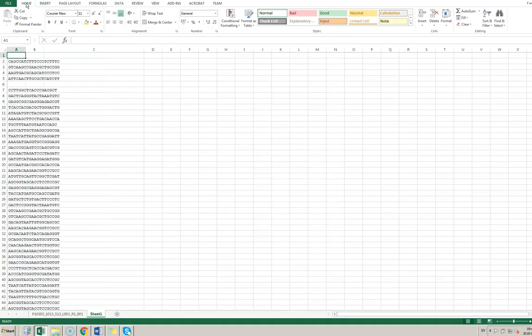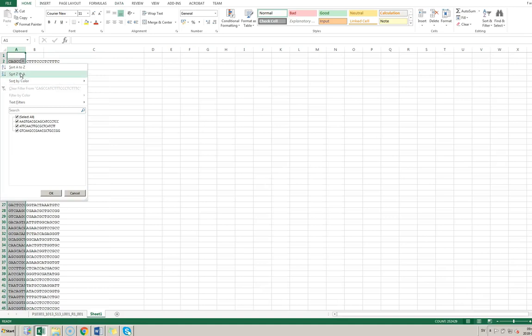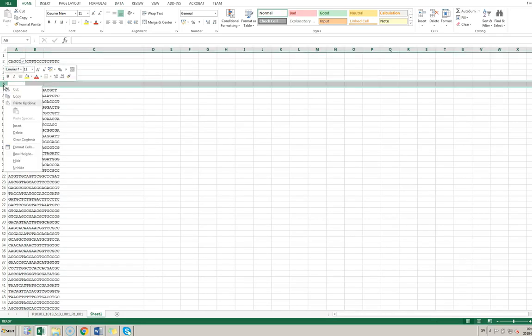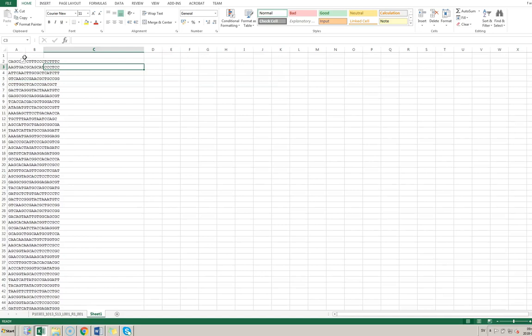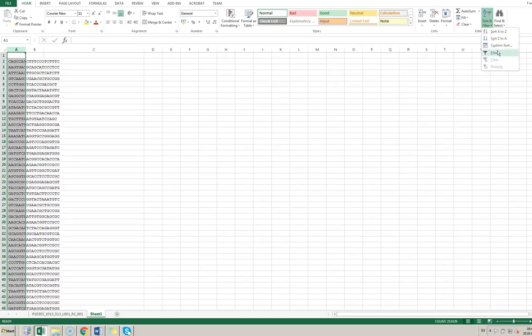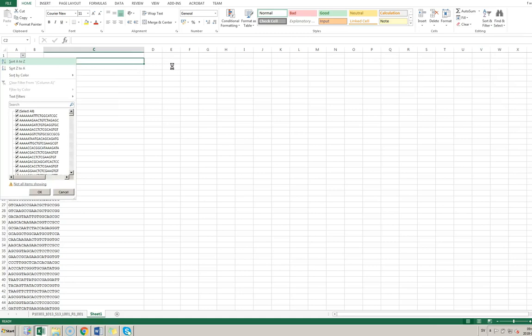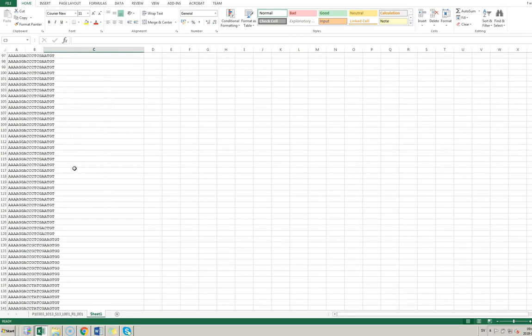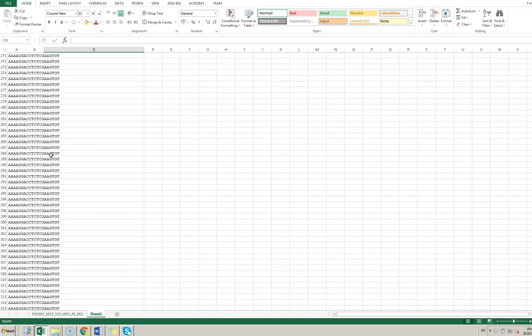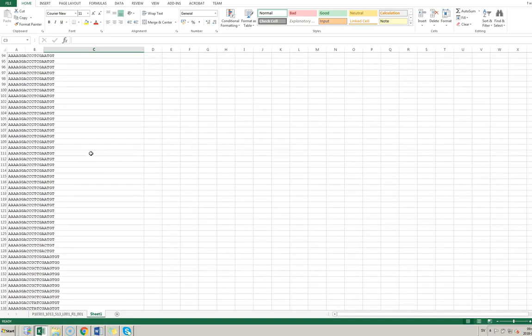We can now sort these sequences if we want — filter and sort A to Z. You'll see that some sequences are a little bit different in size; that could be errors, but it could also be because we used guide RNAs of slightly different sizes from libraries that had shorter or longer sequences.